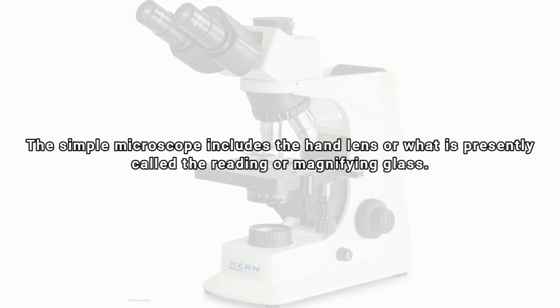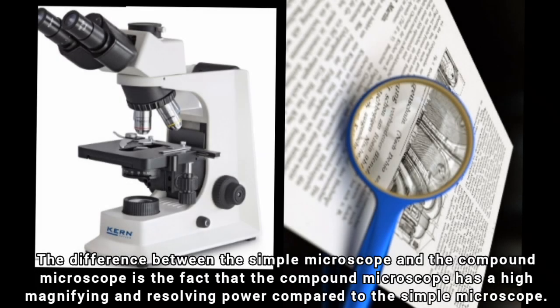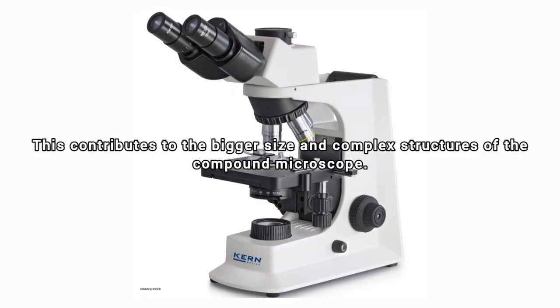The simple microscope includes the hand lens, or what is presently called the reading or magnifying glass. The difference between the simple microscope and the compound microscope is the fact that the compound microscope has a high magnifying and resolving power compared to the simple microscope. This contributes to the bigger size and complex structures of the compound microscope.